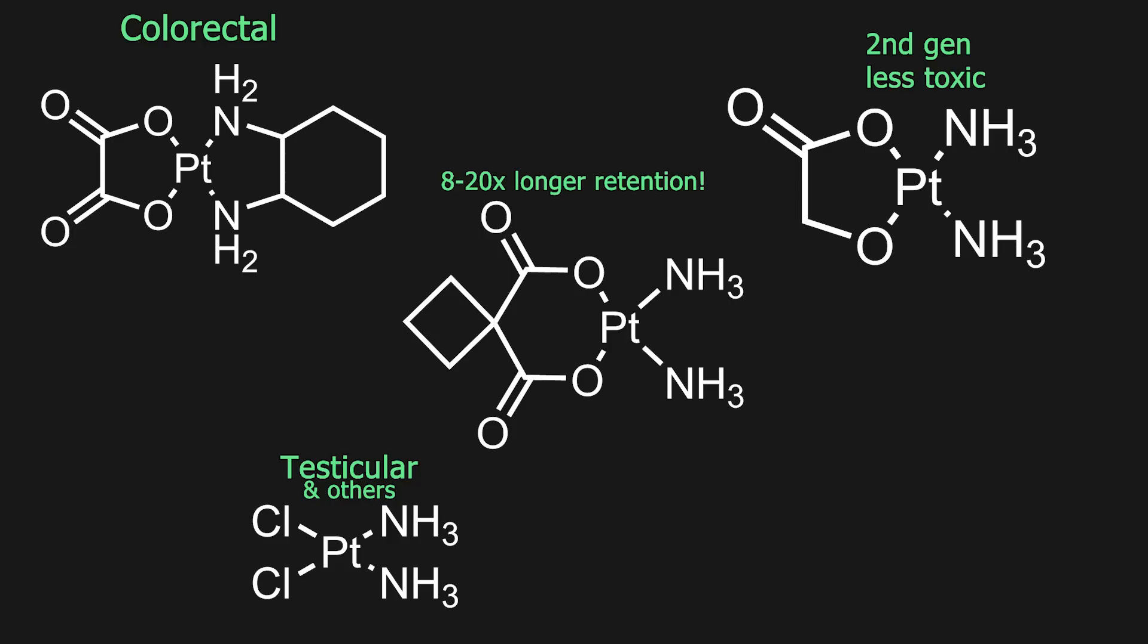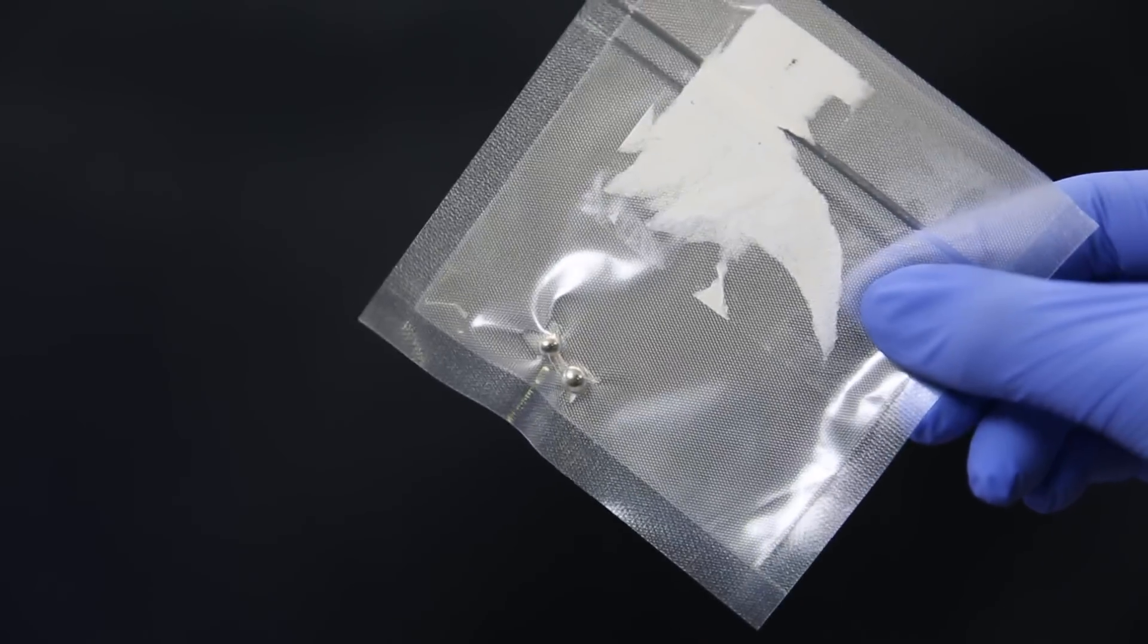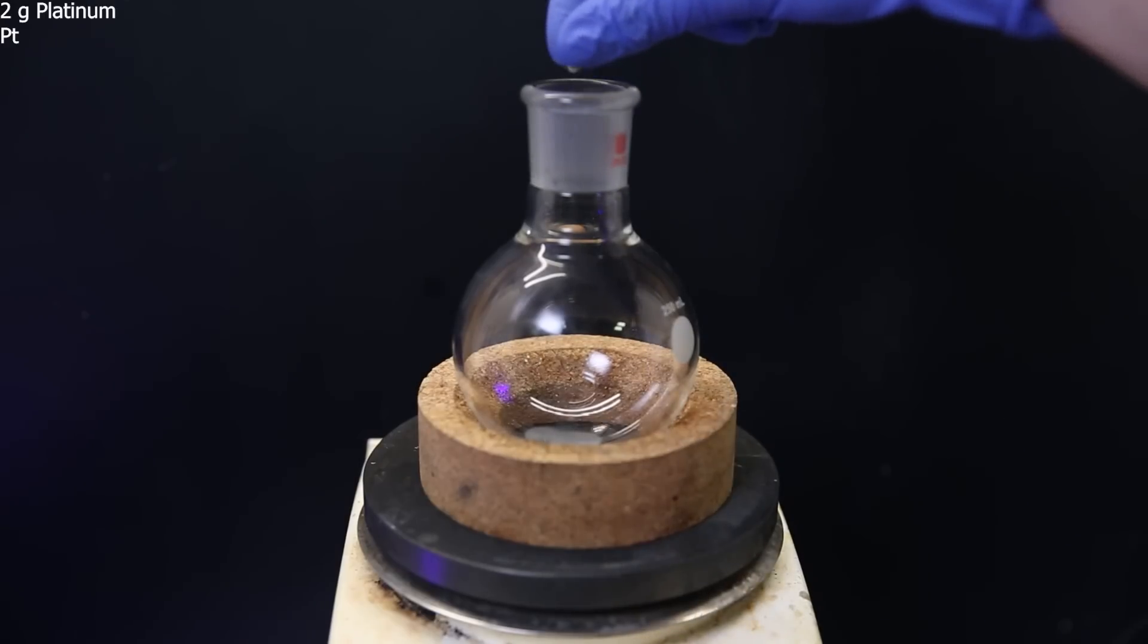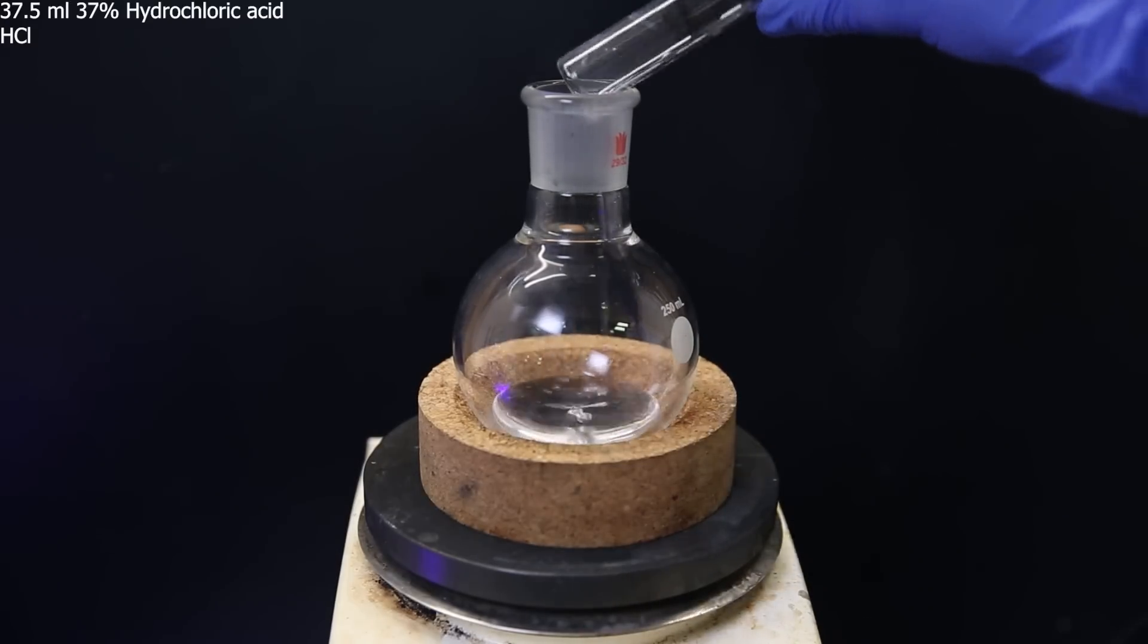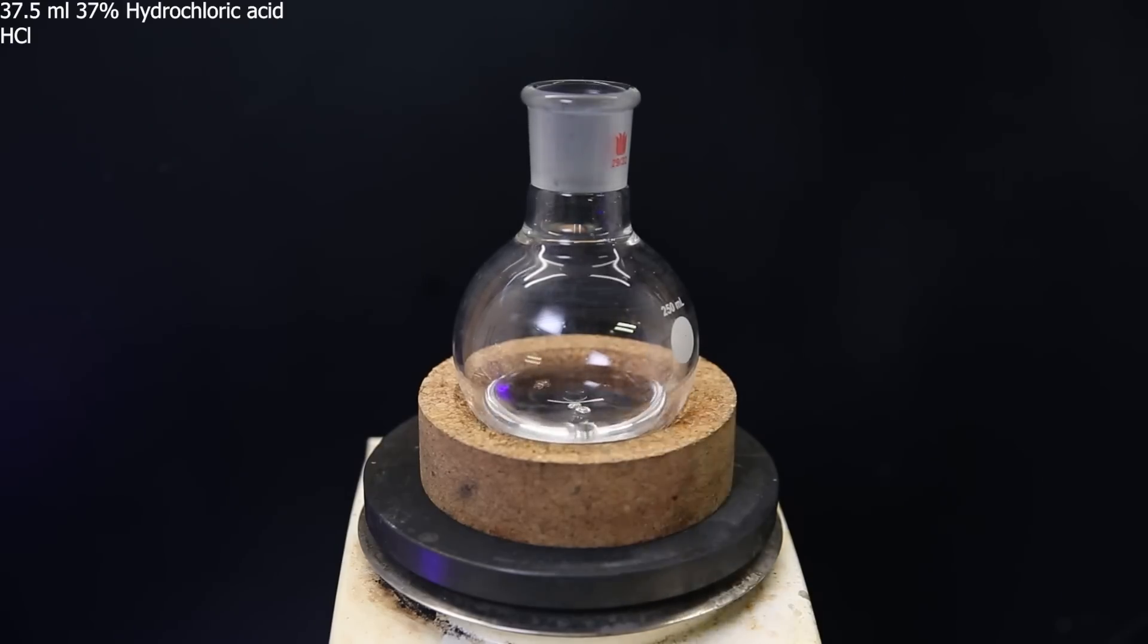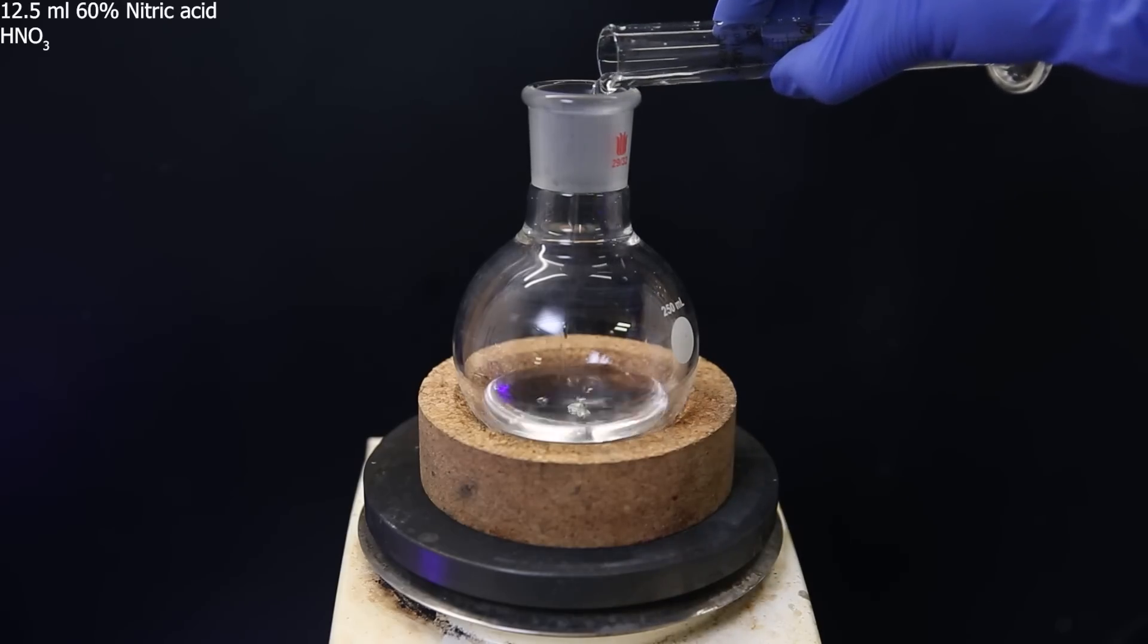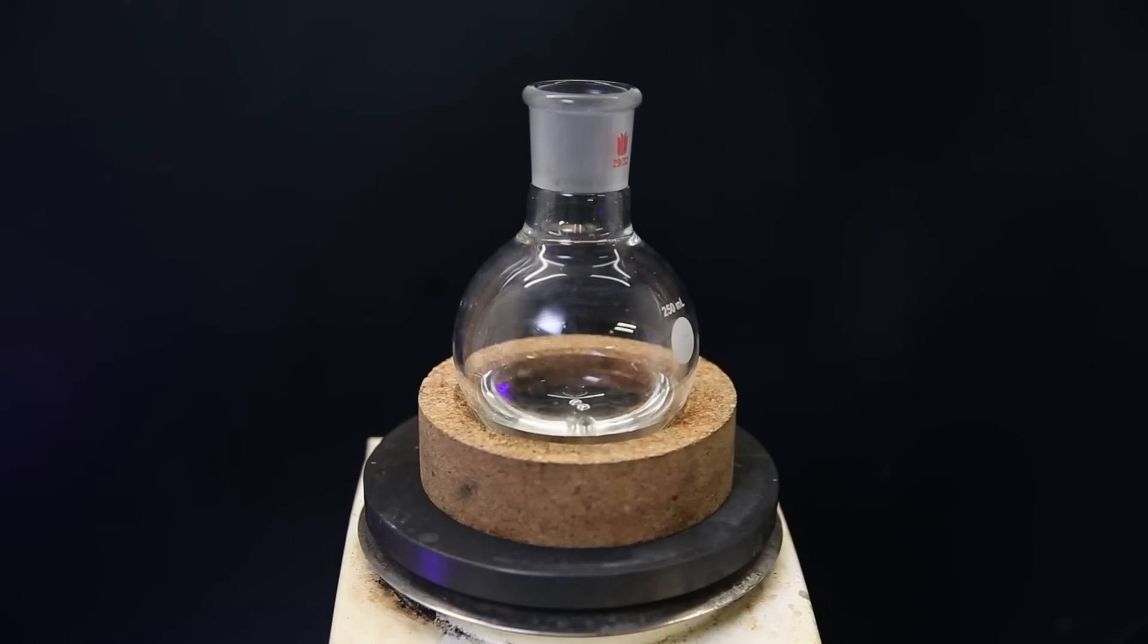Now let's make it, starting from platinum metal. Here I have exactly 2 grams of platinum metal, and it will have to be dissolved first. So I add it to a flask, and on top of that, I add 37.5 mils of 37% hydrochloric acid. Then I add 12.5 mils of 60% nitric acid, which together form aqua regia, which can dissolve noble metals like platinum and turn it into hexachloroplatinic acid.